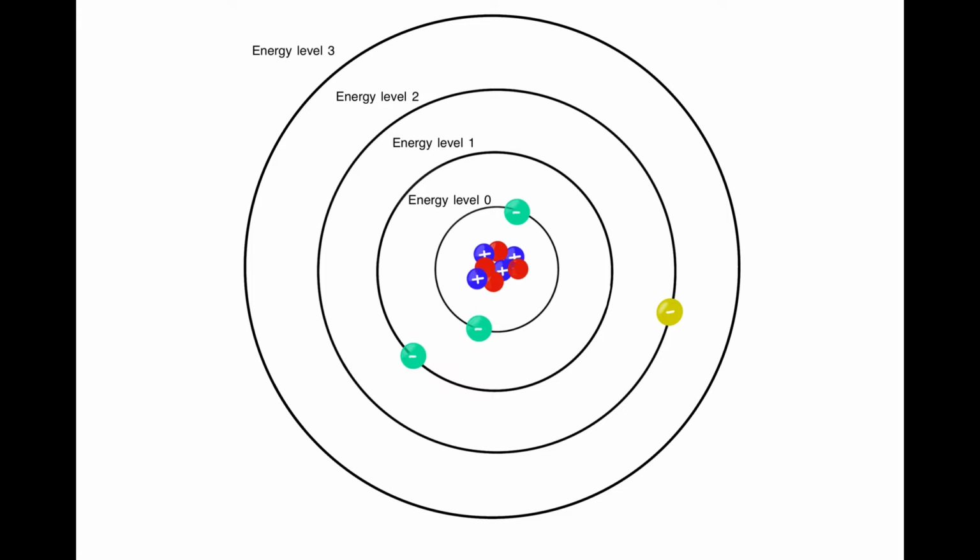In the ICP technique, the source of the heat is the argon plasma, which has a temperature of around 10,000 Kelvin. When electrons return to their ground state or to a lower energy level, they emit a photon of light with a specific wavelength. This wavelength depends on the energy gap between the orbits which the electron transition takes place.